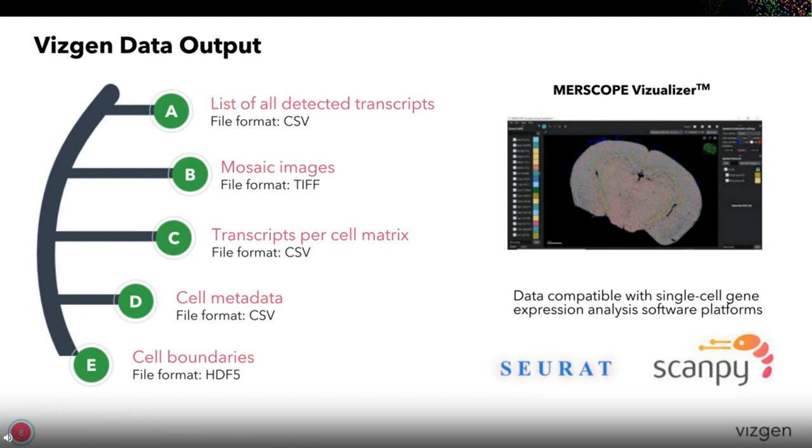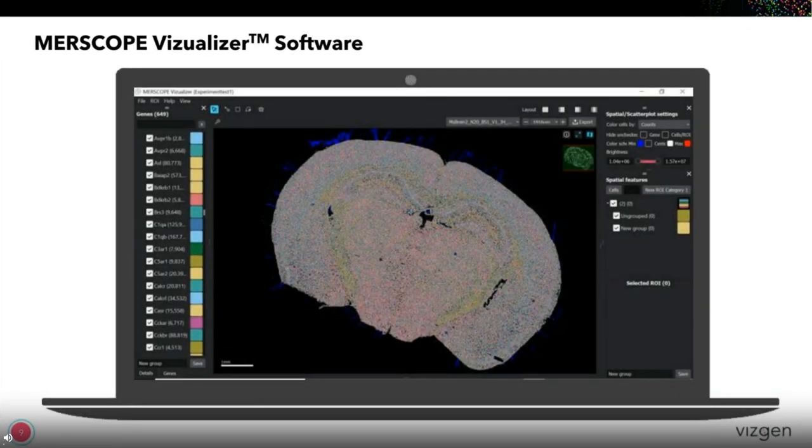So you can use software packages such as Scanpy or Seurat to analyze the data. And alternatively, we have also developed MERSCOPE Visualizer to facilitate the data analysis and visualization, as illustrated by this slide here.